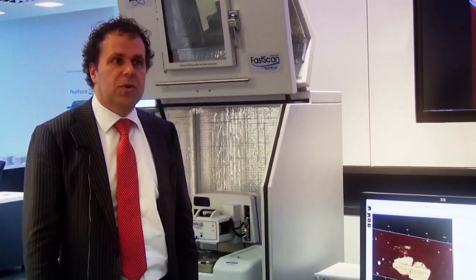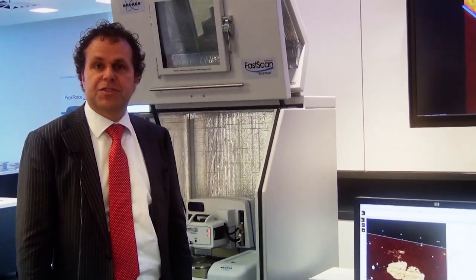We were given the offer for the Bruker Nano Surfaces division to come and join, make the building somewhat longer and have a facility for us as well to demonstrate. Immediately we thought it was an excellent opportunity because it would give us more interaction between customers that come for Bruker AXS equipment as well as for Bruker Nano Surfaces equipment, and it would give us a new home to work in.